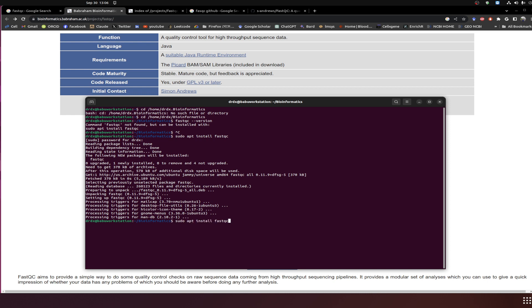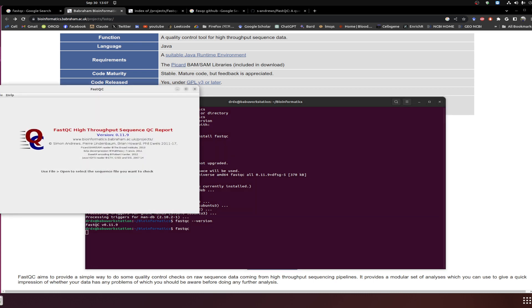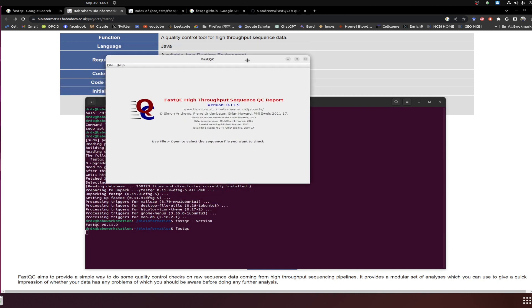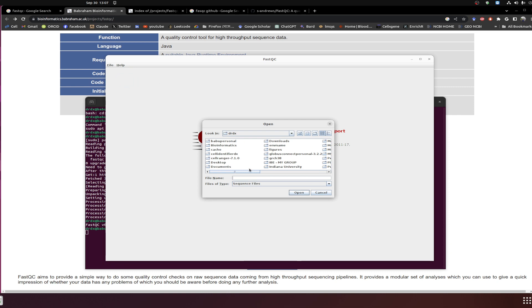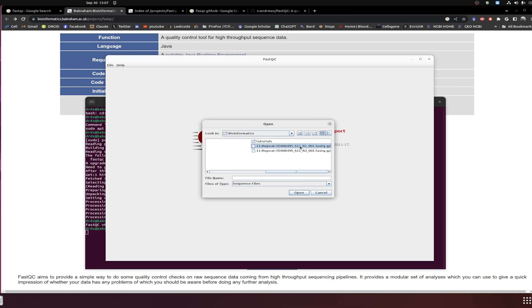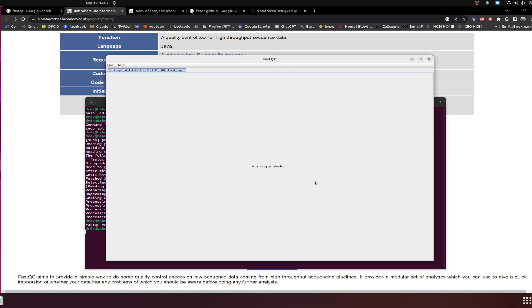Now that it's installed, type 'fastqc' and a GUI screen will pop up. This screen shows FastQC for high-throughput sequencing, the version number, Babraham Institute, and contact details. To run an analysis, simply click 'Open' and navigate to the folder where you have your FASTQ files. Select your file and click done — it will automatically start the analysis.